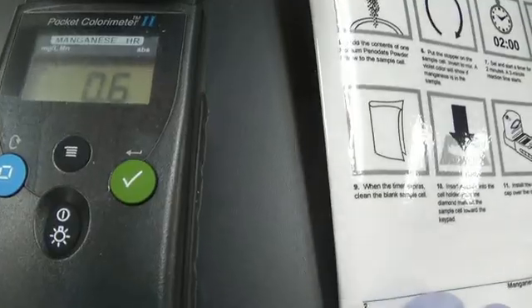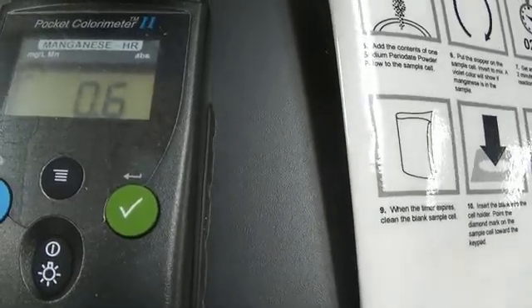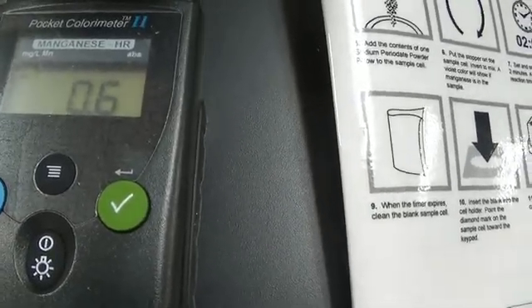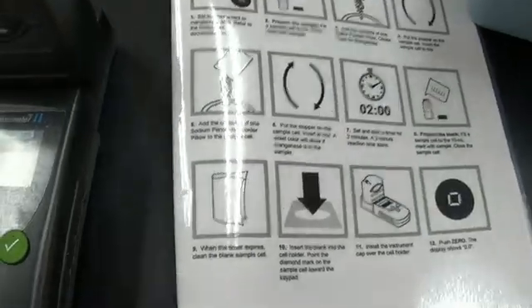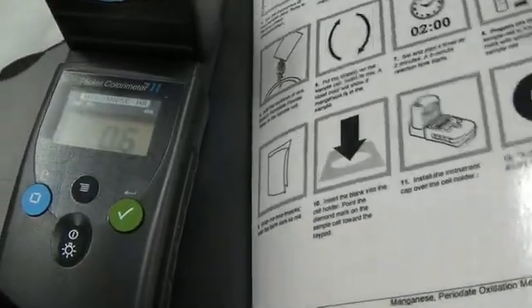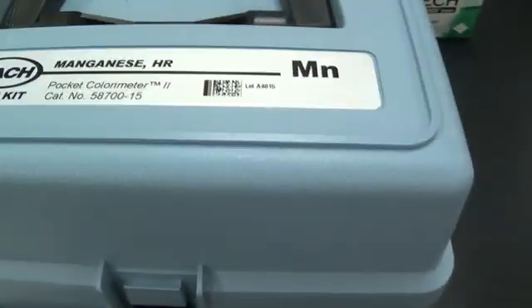So there we go. We have 0.6 milligrams per liter of manganese in our sample. It seems like we didn't need to use the high range kit.